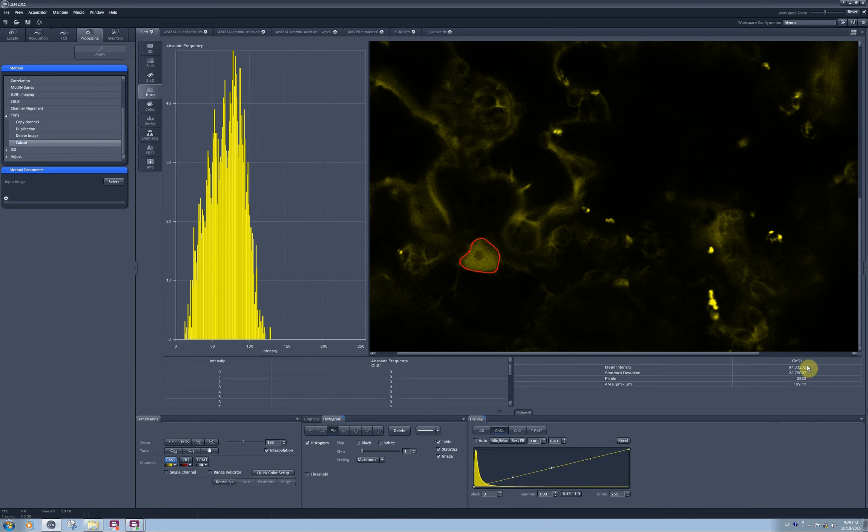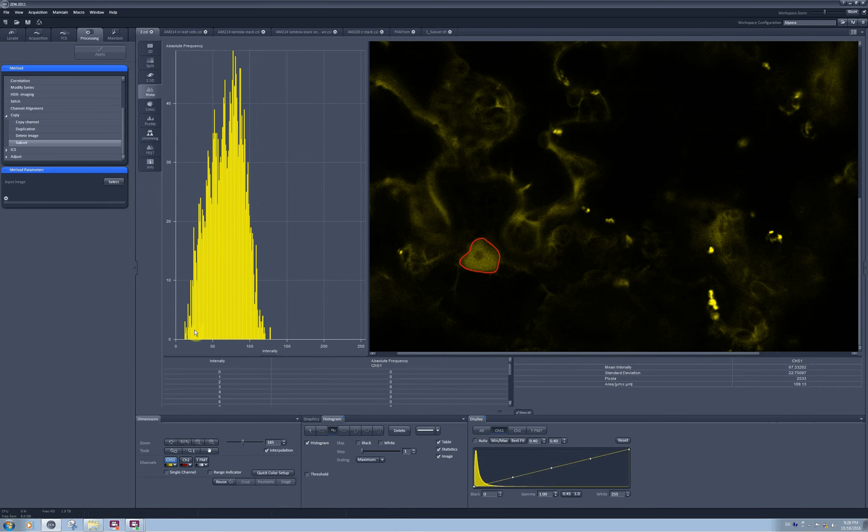And now I have only 100 square micrometers area and the standard deviation went way down. And here I can see the plot of the absolute frequency for pixels of each intensity.